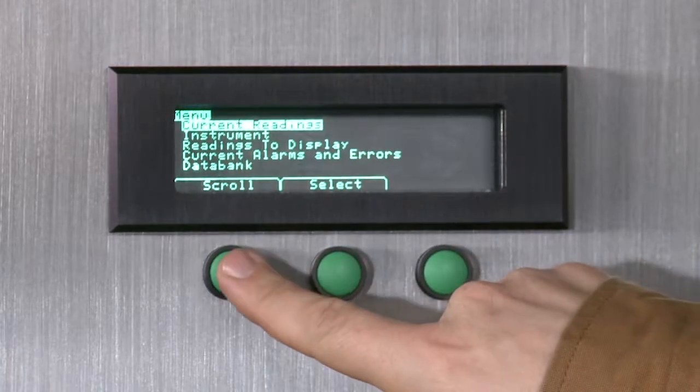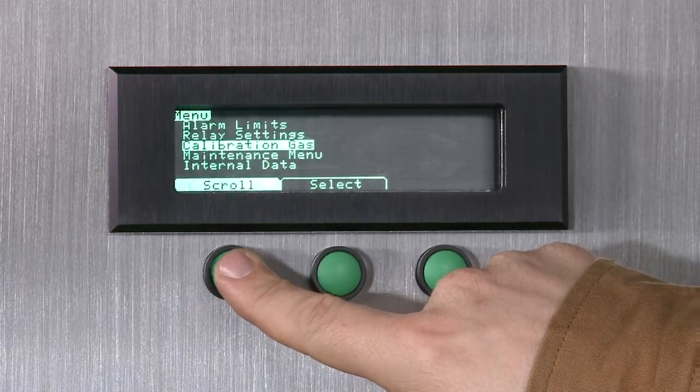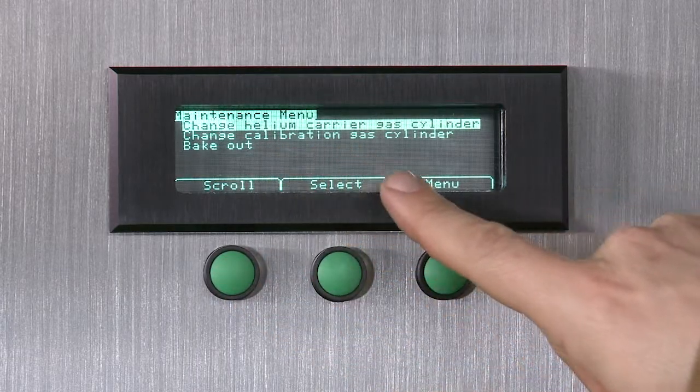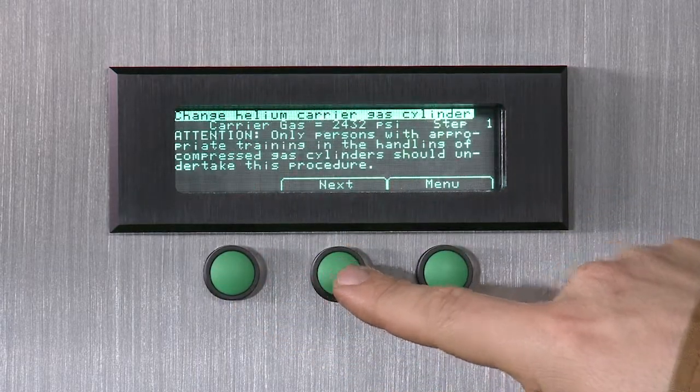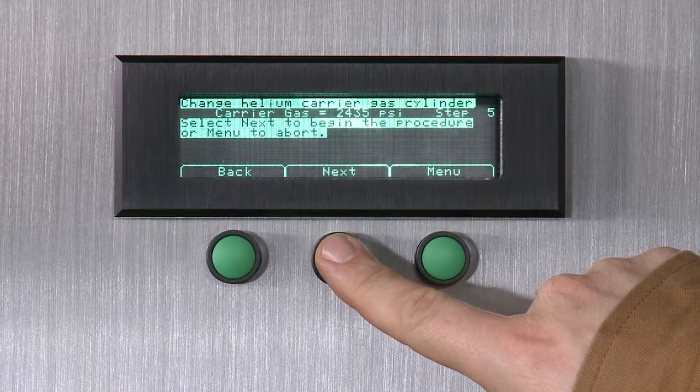Once the display menu is illuminated, navigate to the Maintenance menu and select Change Helium Carrier gas. Read the on-screen information and press Next. Press Next to begin the procedure.